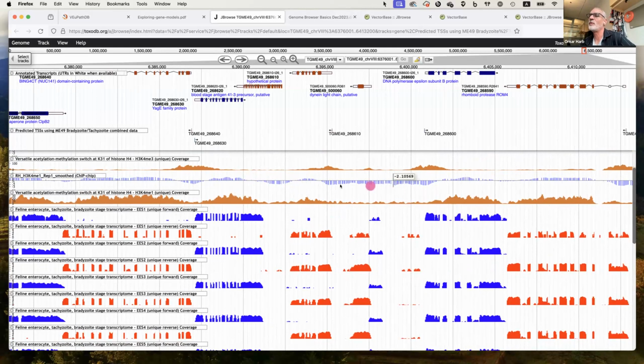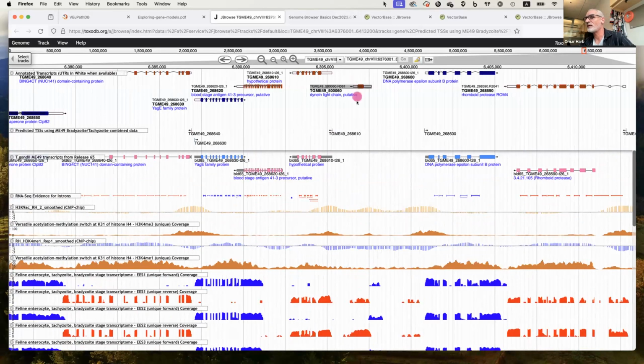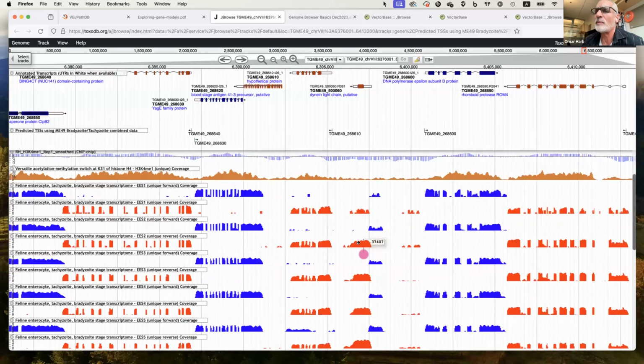Okay. So without knowing anything about this, I would assume that this is marking transcriptional units, the actual genes themselves. And so you can then use this in association with all your other data to confirm whether the gene exists in that region, and if you're interested in promoters, you would then look at this type of data. And I'll maybe highlight one more thing.